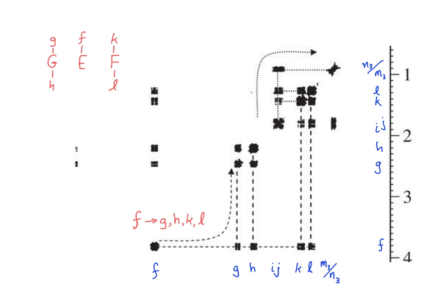And so that leaves us with the only possibility, again ignoring long-range couplings, for the bonding pattern carbon G bonded to carbon E bonded to carbon F. Based on the chemical shift of carbon E and proton F, and knowing that the formula has 1 oxygen present, it is reasonable to claim that the oxygen atom, which I will color in as O, is bonded to carbon E. In addition to confirming that protons G and H are coupled, as they are chemically non-equivalent but on the same carbon atom, carbon G, we can then look at other correlations.